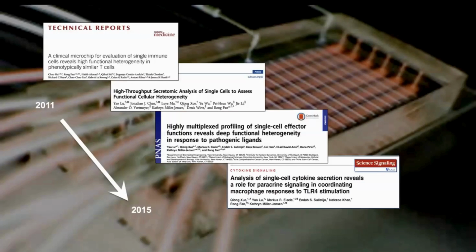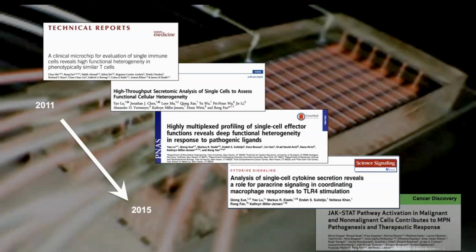Okay, I took this device to Yale and talked to my clinical collaborators. Can we apply this technology to the characterization of immune cells in the context of cancer immunology? And I realized that although I love it, my clinical collaborators had no idea how to use this complicated-design microfluidics, and that becomes an engineering problem. And since I'm in an engineering school, I said, okay, let's go ahead and take on that challenge and further develop the technology to make it much more scalable. You can measure hundreds or even thousands of single cells. We hadn't demonstrated the full spectrum of immune effector proteins for all T cells yet before I started at Yale. And so, okay, we still need to meet that goal told by Mario, like 42, 45 different immune proteins.